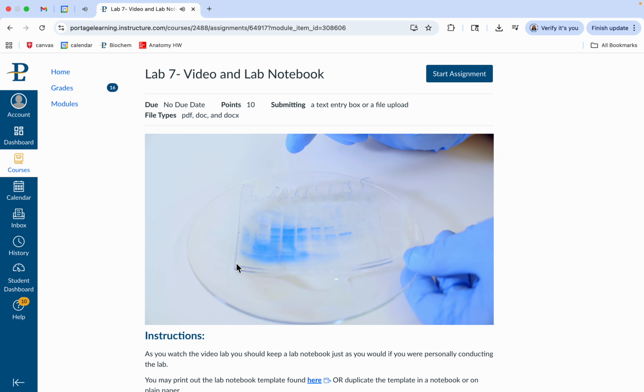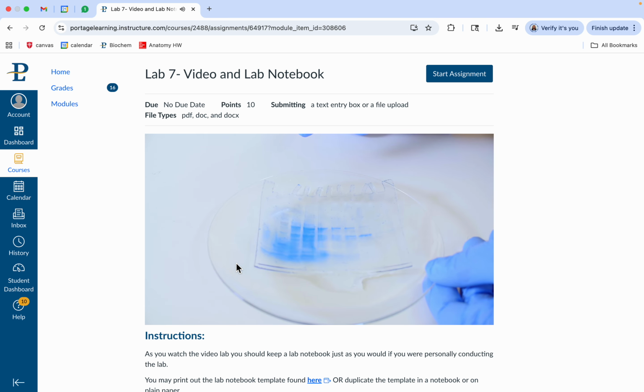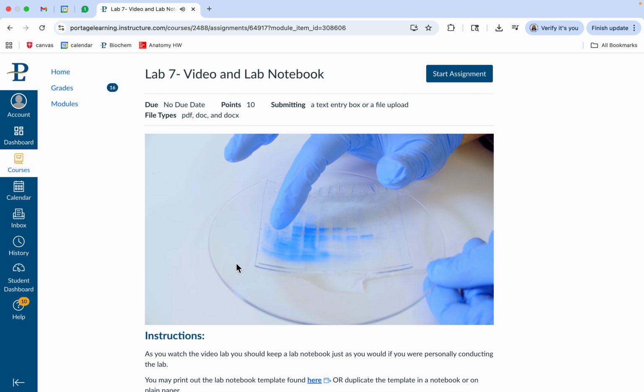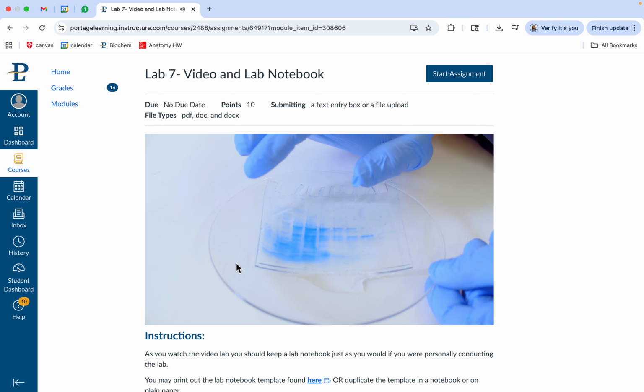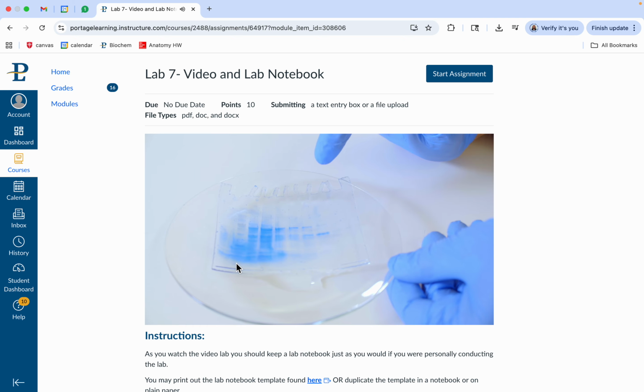All right, so one of the things that you can notice is that we have several lanes on here. This first one is our molecular weight marker, so notice there's a whole bunch of those. One of the keys that we want to make sure we notice is that this marker right here is about 48,000 Daltons, the one that's right there. That's going to be key because our GOT is a homodimer, meaning 2 polypeptides that are 45,000 Daltons big. And so notice there's a nice line all the way across here indicating that we have GOT present.